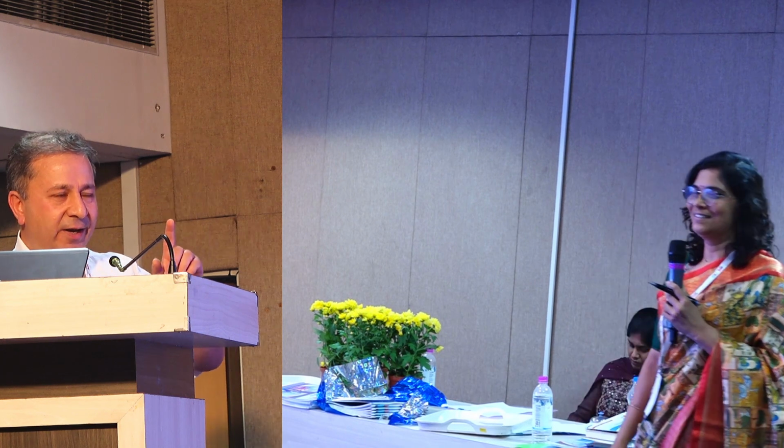So you want to say that you can just get away with CDC, that flow alone is enough? The problem is you guys called it old is gold, so I really don't want to be blasphemous here. But I'm not trying to say that CDC is absolutely useless. Please don't take that message from me. CDC has its own advantage in the entire setting.